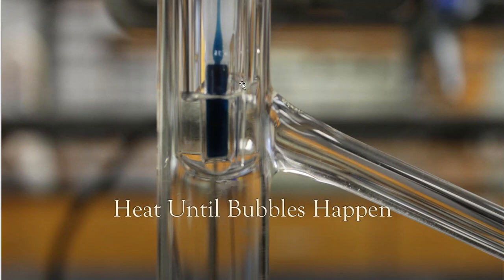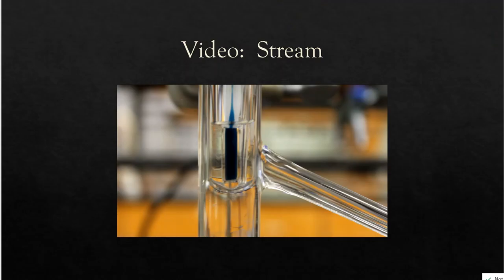So the capillary tube, that's its purpose. That's why we put it upside down. We create almost like an air pocket. So when that temperature begins to boil, the bubbles will come from the capillary tube, and I will start to see a stream of them that will come out very, very fast. This means I'm surpassing the boiling point.